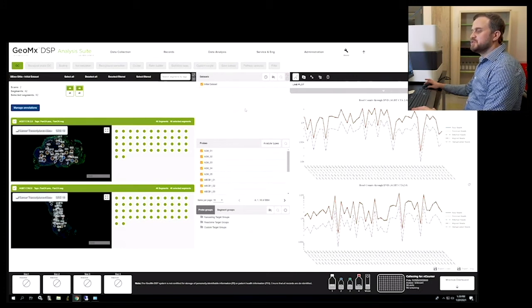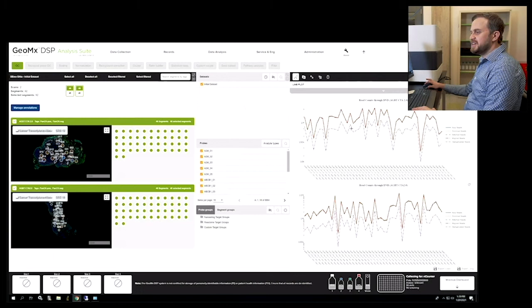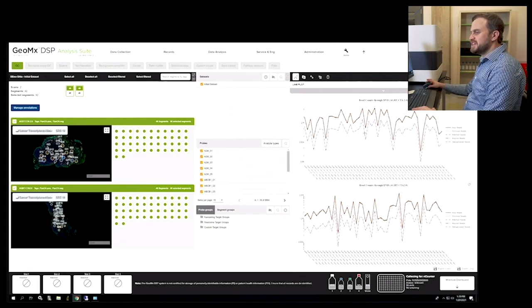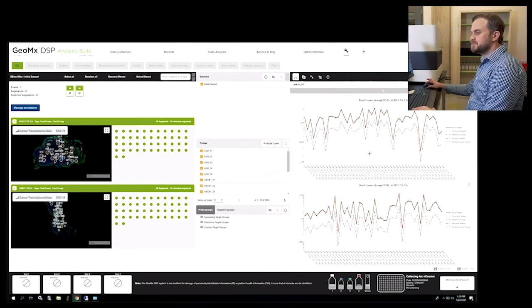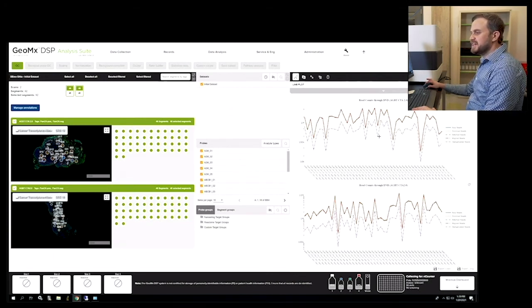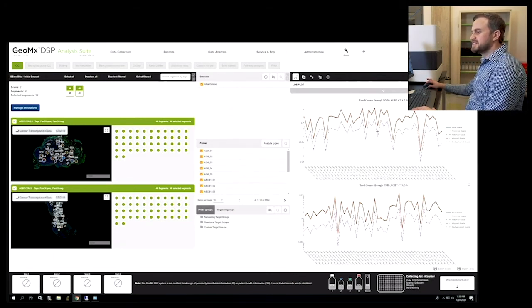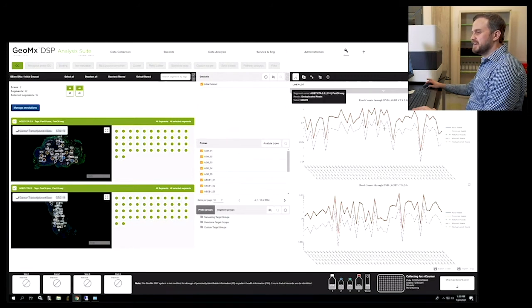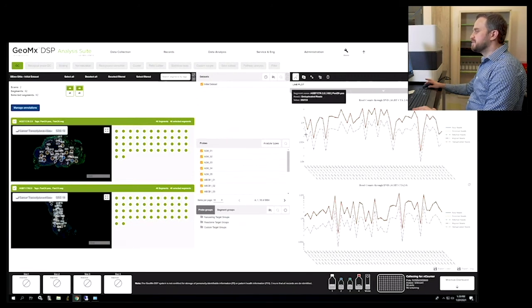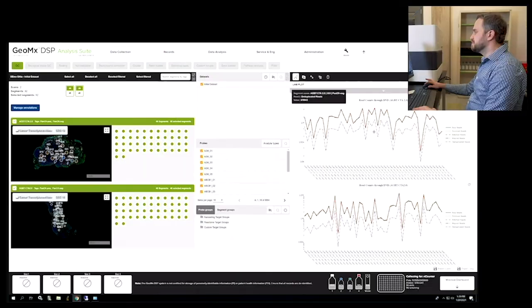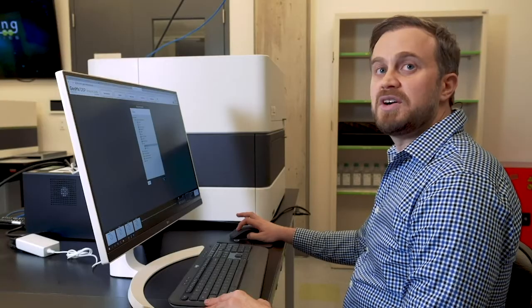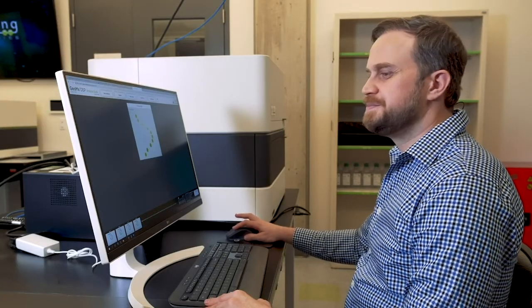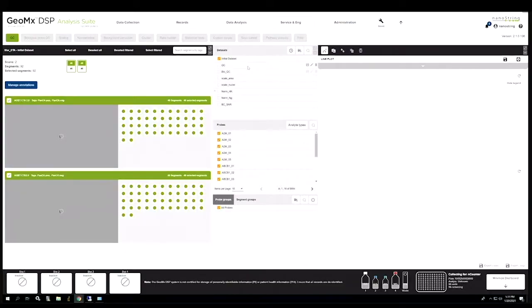The visualizations pane is on the right. Visualizations are visual representations of the data set selected and probe selected, and the adjustments apply to the data set from those probes. Now I'm going to open another study. Here we can see the data has been QC'd and normalized.